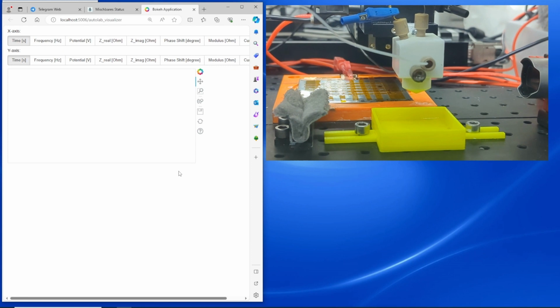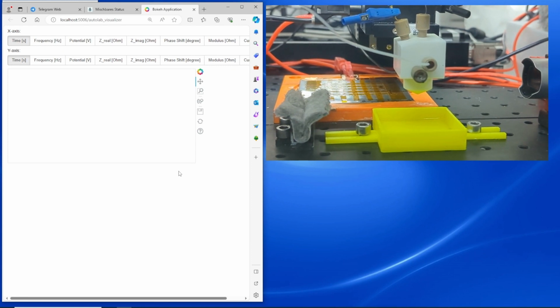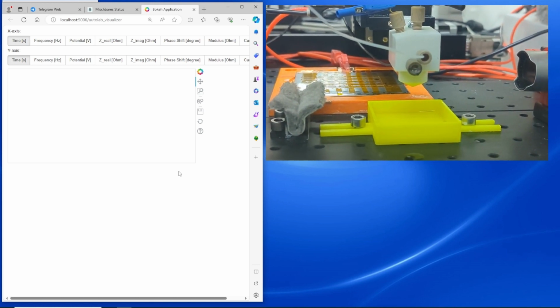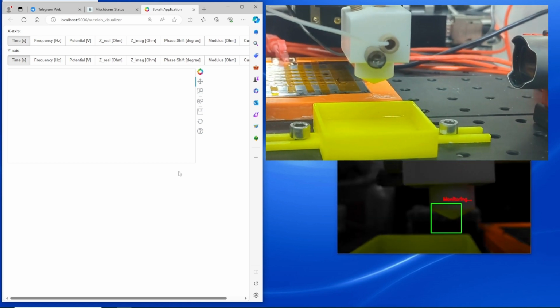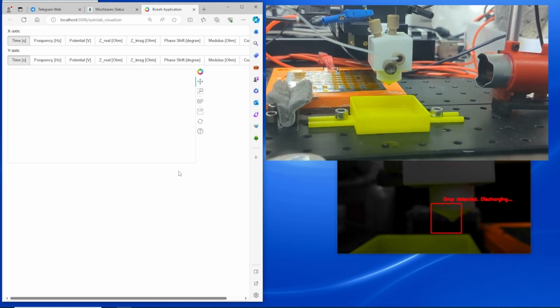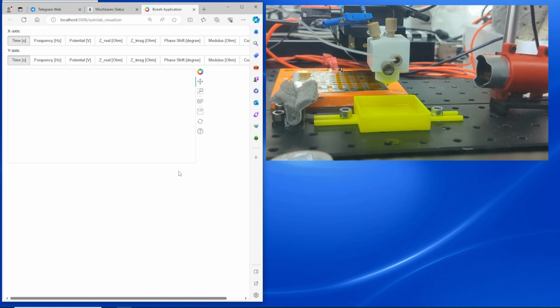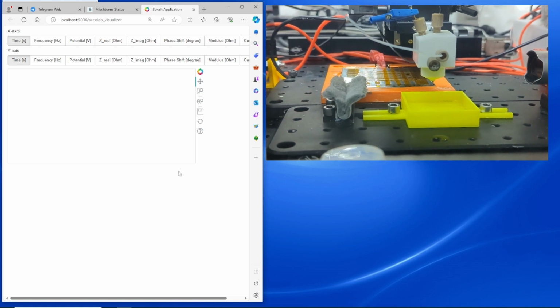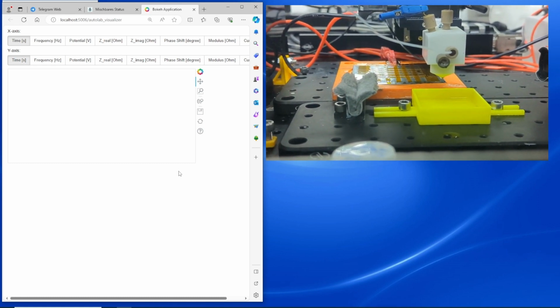As you can see in the video, the motor first moves to the waste position, begins to pump the electrolyte, and simultaneously the camera starts checking for material sufficiency. In our region of interest, the camera detects the discharge of materials. Having confirmed this, we then move the motor to the cleaning position to address any residuals on the scanning droplet cell that might cause measurement issues.